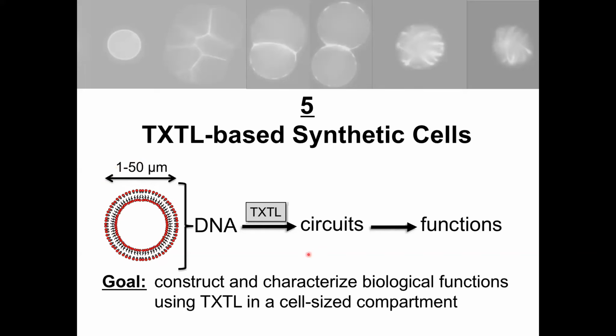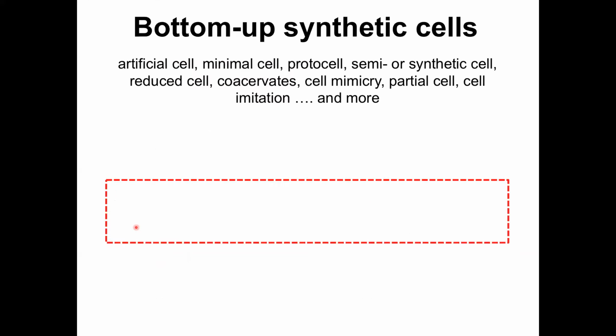And you can do exactly the same as in a test tube. You just have to use a method to encapsulate the reaction, and then you will see GFP expressed after a few hours. Before going to this, to show some expression in liposomes, let me cast a little bit the landscape here. There are different types of bottom-up synthetic cells.